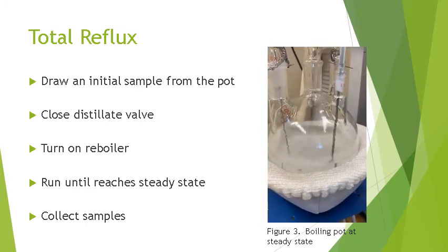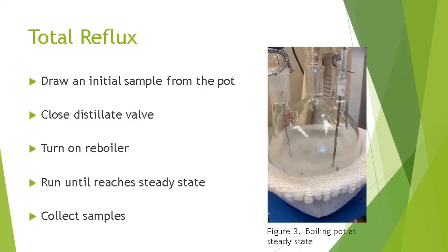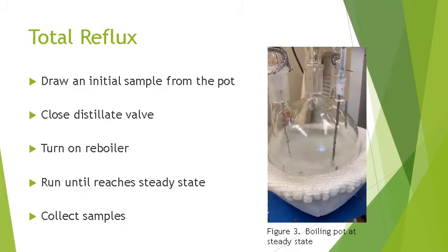If the temperature rises above the expected boiling point with no bubbles forming, make sure to notify a TA or instructor, because this could be a sign that the system is superheating, which can cause bumping of the distillation column. Run the system until steady state is reached.